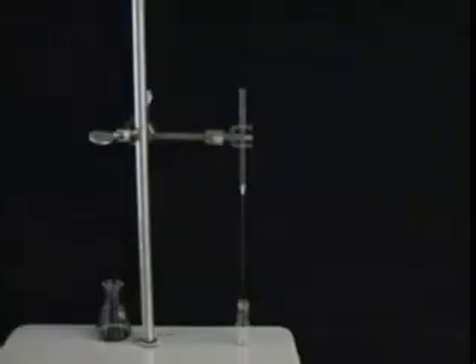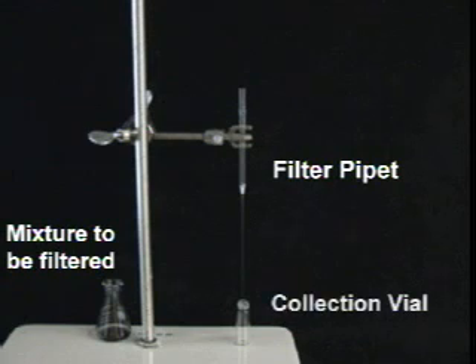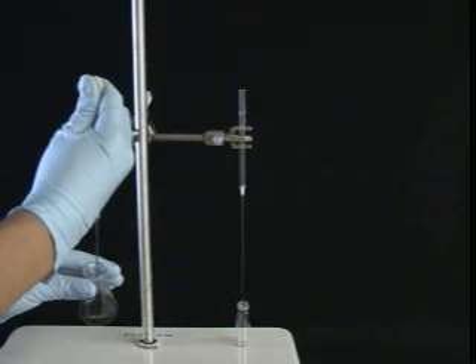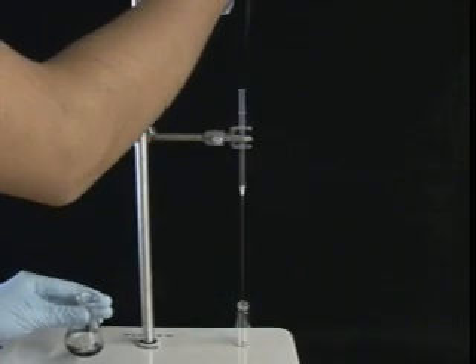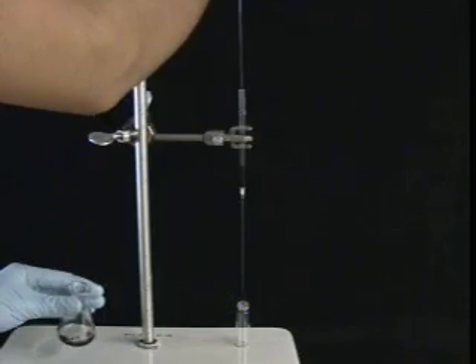Now for the setup. Here we have the mixture to be filtered, and here we have our filter pipette, which is securely clamped to a stand. We've placed a collection vial underneath it. Now it's time for filtration! Draw up some of the mixture with another pipette and transfer the mixture to your filter pipette. Allow it to do its filtering job.